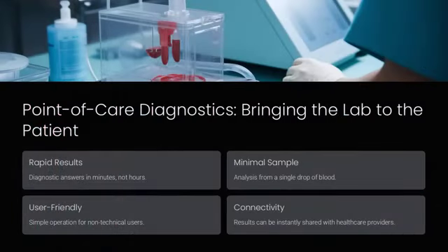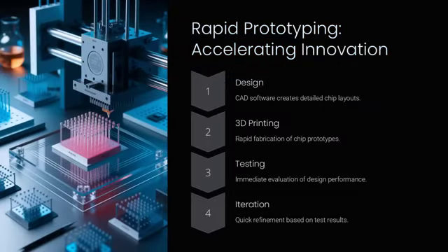Integrated optical components such as waveguides and photodetectors enable sensitive spectroscopic analysis on chip, for instance. An optical sensor can monitor subtle changes in light absorption during a reaction, much like a digital camera captures high-resolution images by detecting minute variations in light.